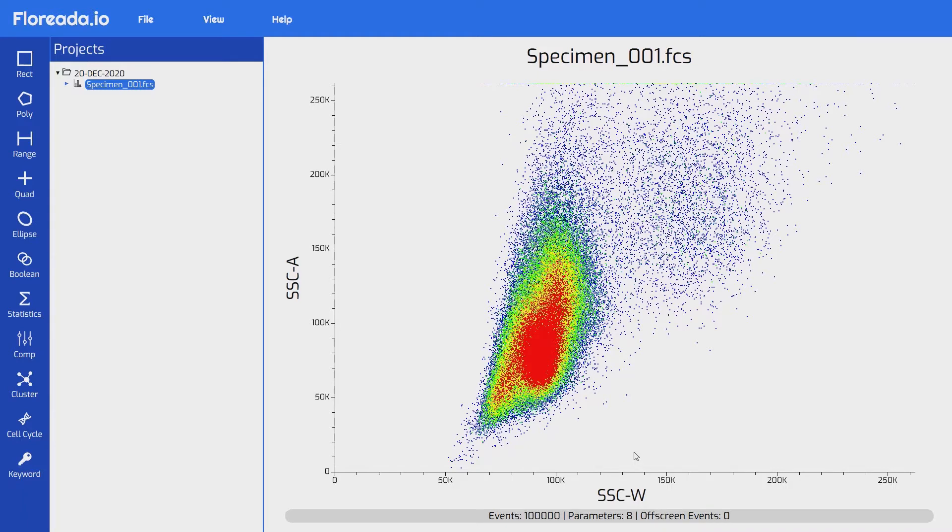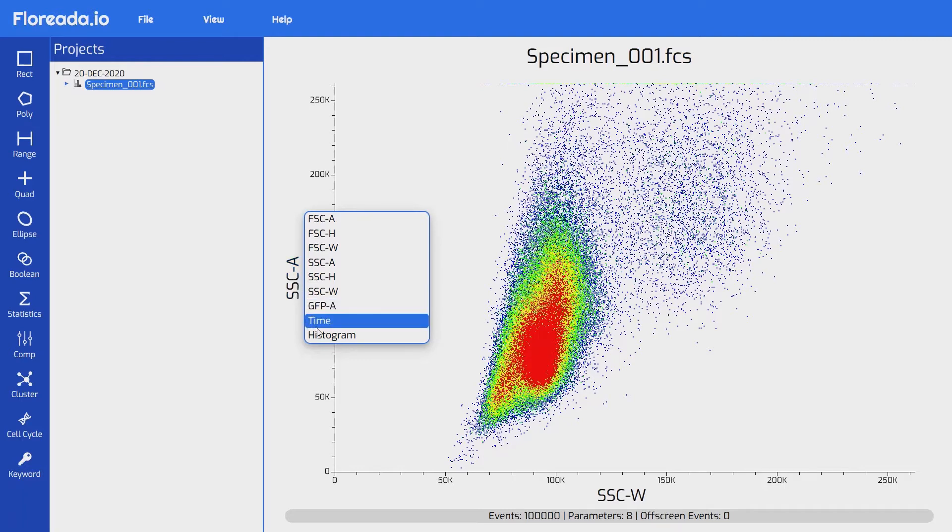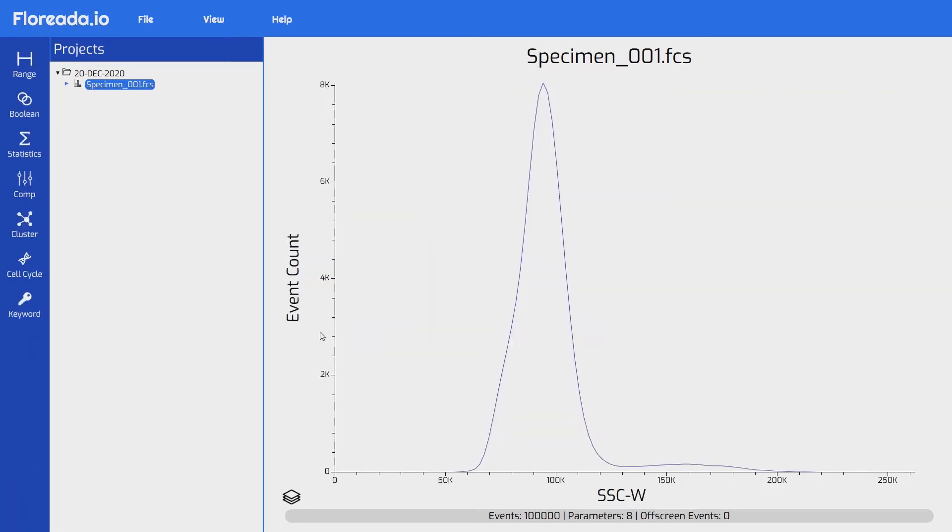You can do the same on the Y axis. If we'd like to see the data displayed as a histogram, we can go over to the Y axis parameter and click that. You'll notice that all the parameters that are on the X axis are there, as well as a histogram option at the bottom. If we select that one, we'll see the data as a histogram. I'm going to put it back how we originally had it.